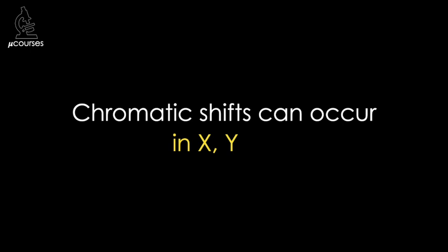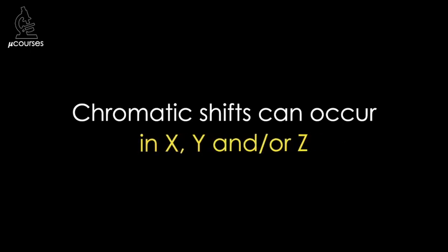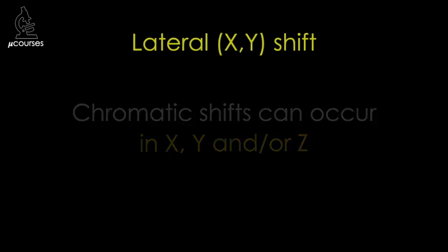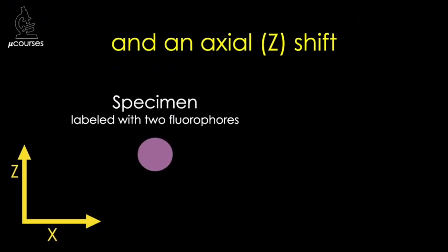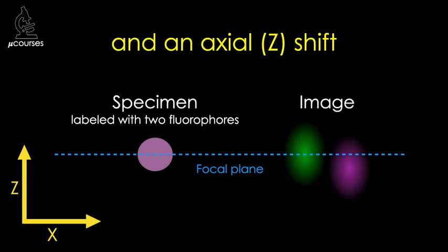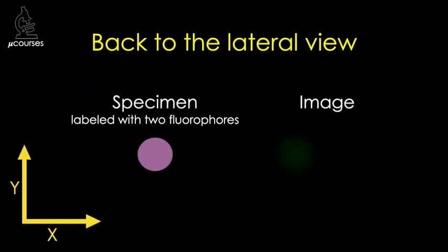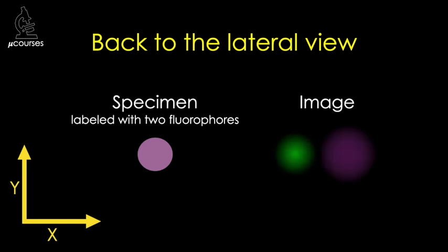So far I've been showing lateral chromatic shifts, but your microscope can also introduce axial chromatic shifts, and most often you'll see a combination of both. If we collect a series of images at regular intervals along the z-axis — often called a z-series or an image stack — and look at an orthogonal view of the image stack, we can see that the green and magenta images are also shifted axially, such that they appear to be in different focal planes. If you're not sure why the image of the bead is elongated in the orthogonal view, please check out the point spread function microcourse. If we go back to the lateral view and focus on the green fluorescence and then collect an image of the magenta fluorescence, we'll find that because of the axial shift, magenta will appear out of focus.